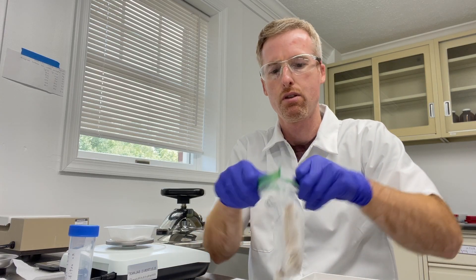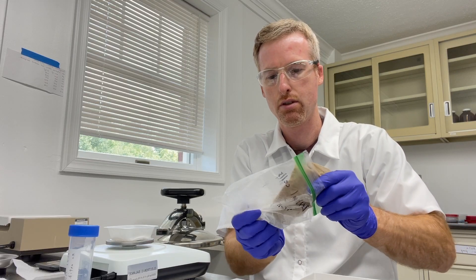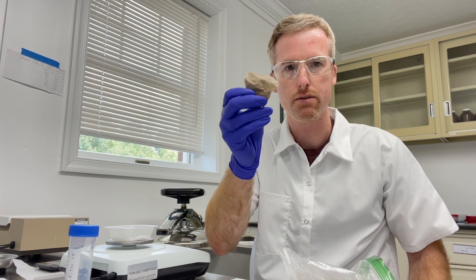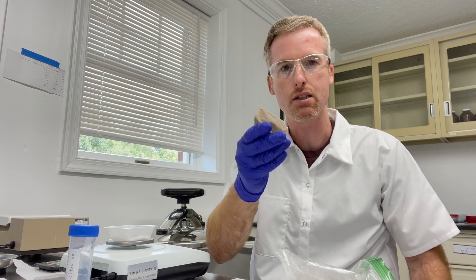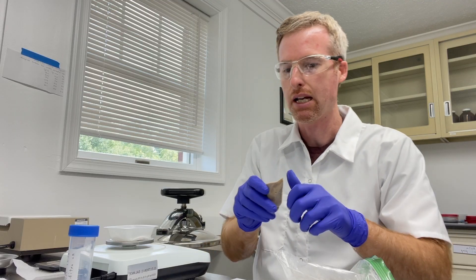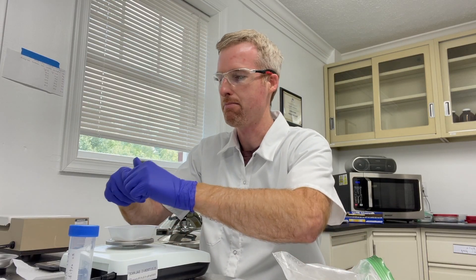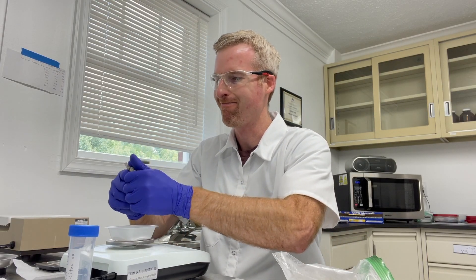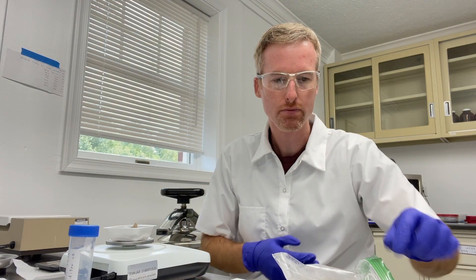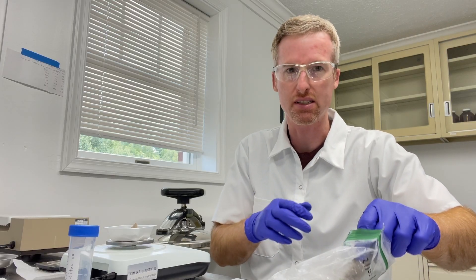All I have to do is open up the bag and take out the cracker of cells. This is just the pelleted E. coli — it's like a brown goo that I put in the bag, but now it's hard. I'm going to break off some and weigh it to see how much I have. It's really cold, that's why I'm wearing gloves — and because it's disgusting.